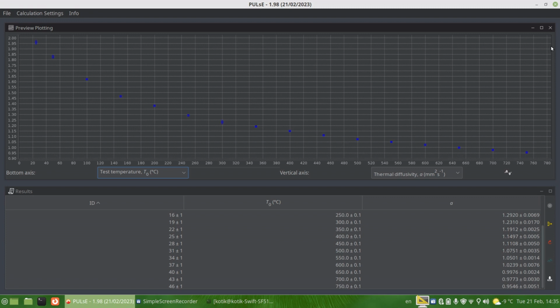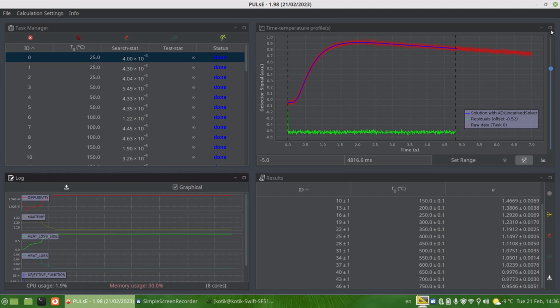And analysis reveals that comparing those values to literature yields very good agreement between the currently calculated values and the literature values. So that means that you have successfully done your job at processing data with the PULsE software for the Pyroceram with 3mm thickness.